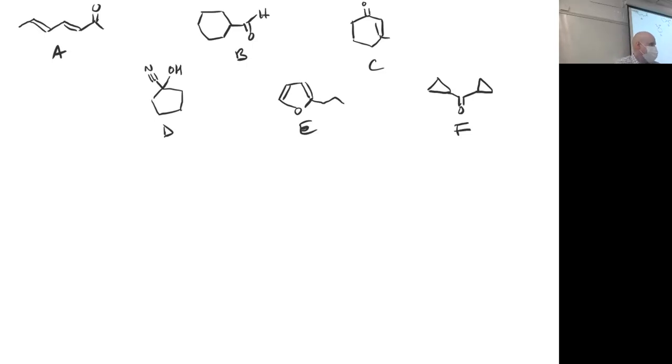It's a pretty likely situation that you're not starting from scratch, much like lab last Monday, Tuesday, today, tomorrow. You're not randomly looking at a molecule. Usually you have some idea of what it could possibly be because you're the one that started the reaction. So when you run an NMR, a lot of times you're not just trying to figure it out from scratch, but you're trying to match to a list of possibilities. So this is another quiz type question that you will probably see. And so that's what we're going to do right now.